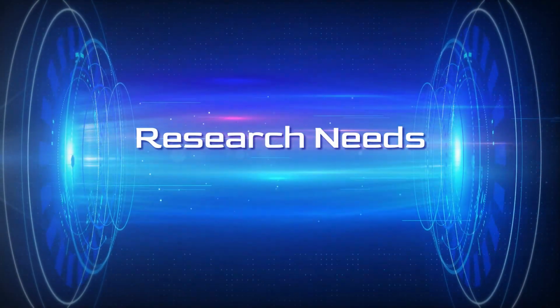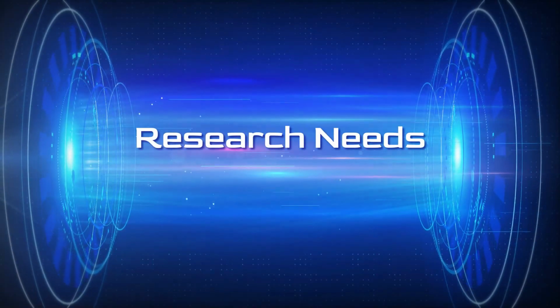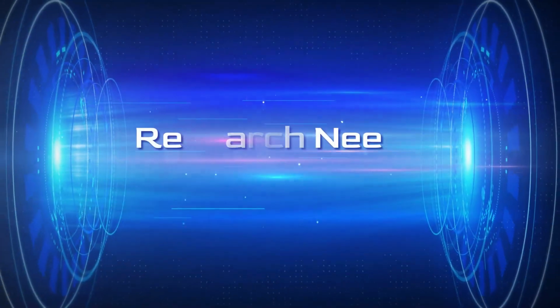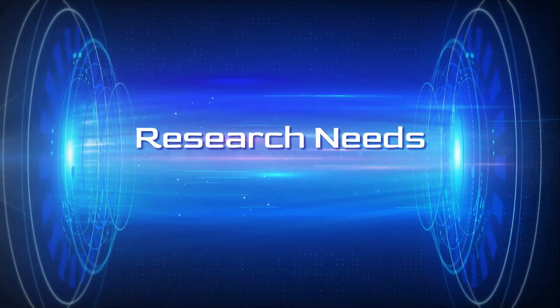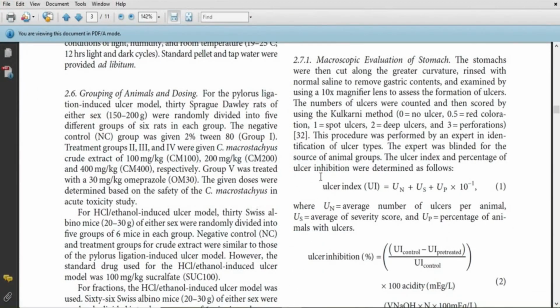Today in this video we are going to see how to calculate ulcer index and ulcer inhibition in percentage for the pylorus ligation experiment. Here we have picked groups: normal control, disease control, standard and treatment.